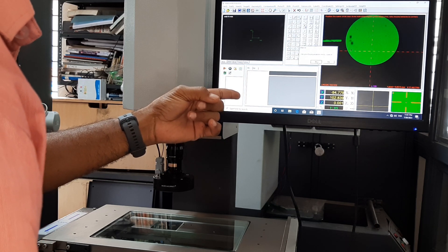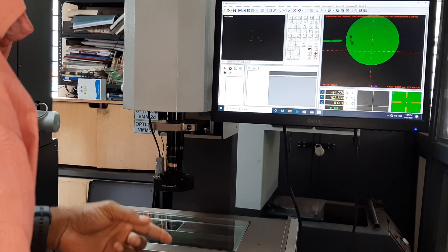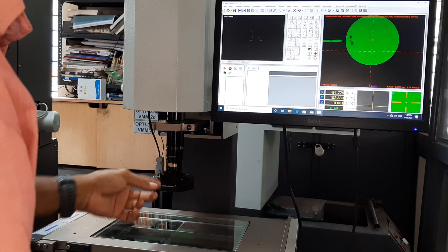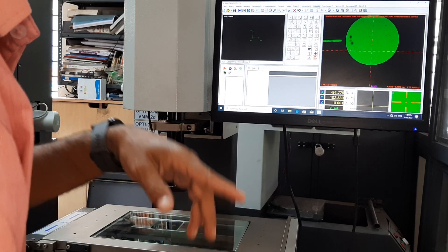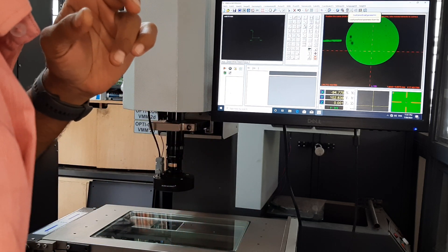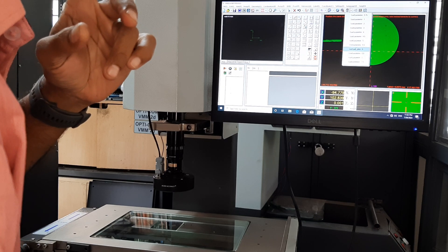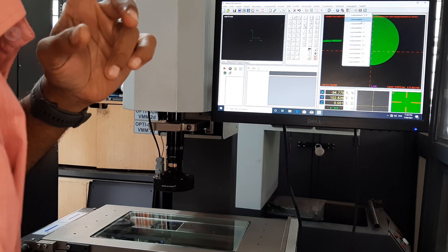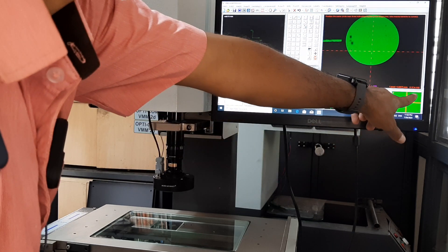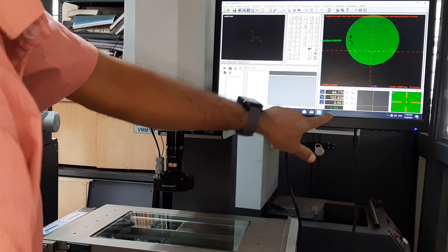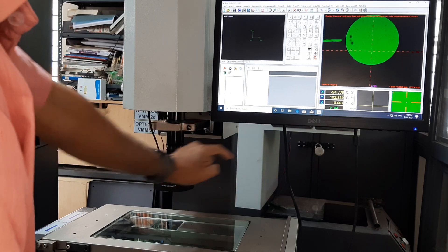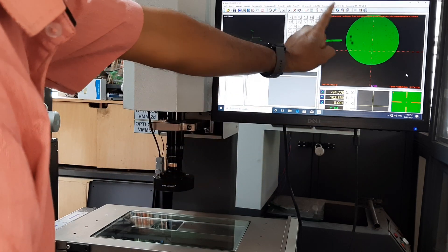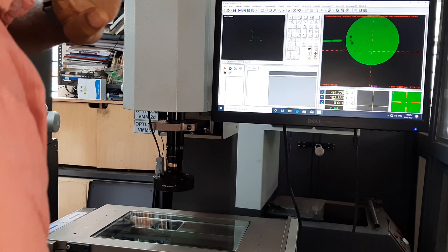You are using 1, so you have to save here. Load 1. So you have selected 1, so always the lens you select and the parameters you load should be the same.